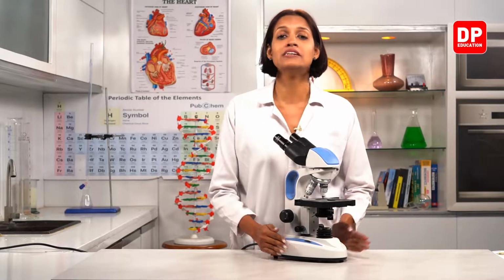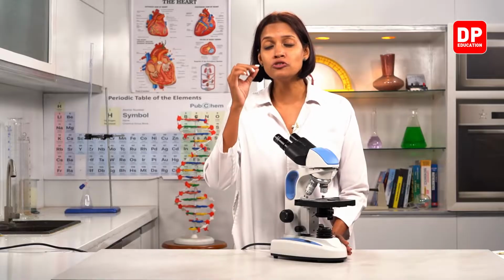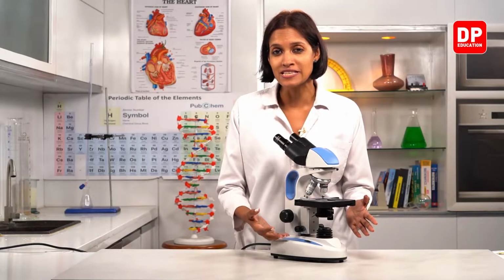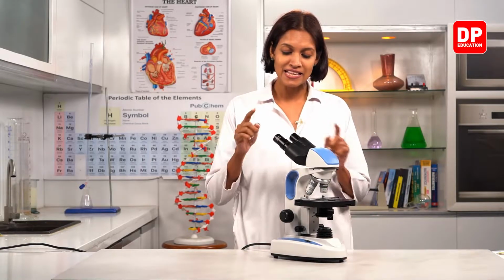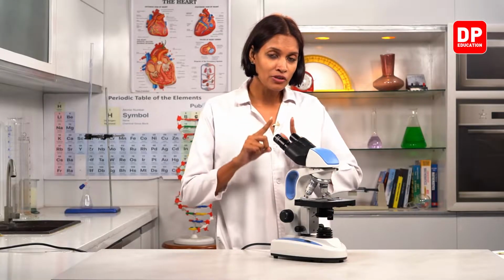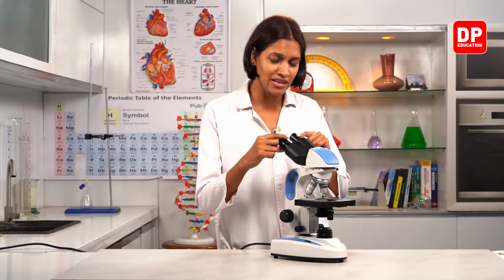Right. Now you all know that we call this unit a compound light microscope. Why compound? Because we look through two lenses, right? When we look at the specimen or an object, we look through two lenses. Where are those two lenses? This is the first lens. Here you can see there are two sides to keep both the eyes we have.